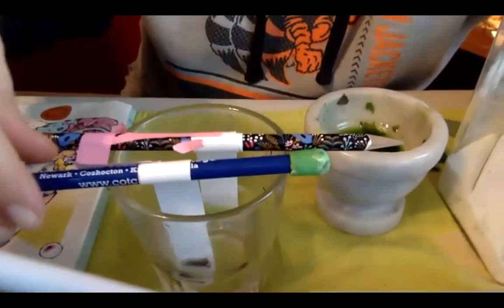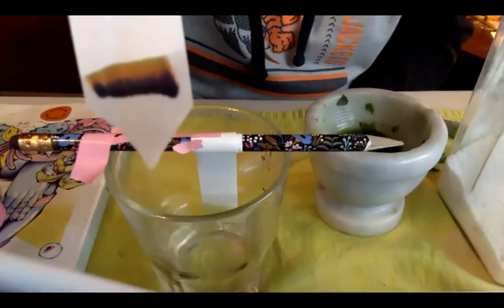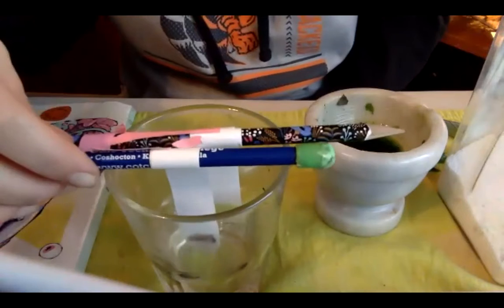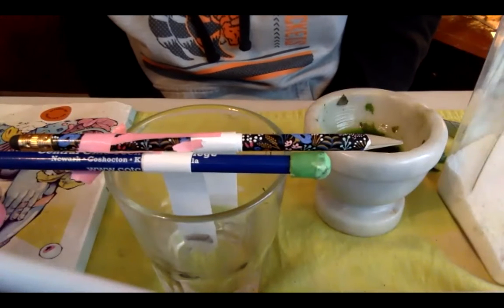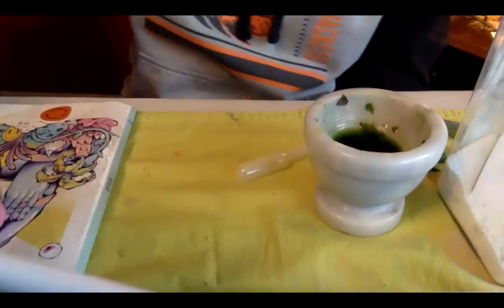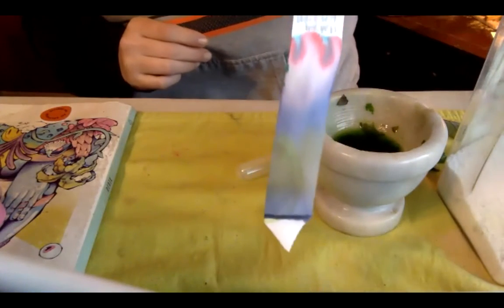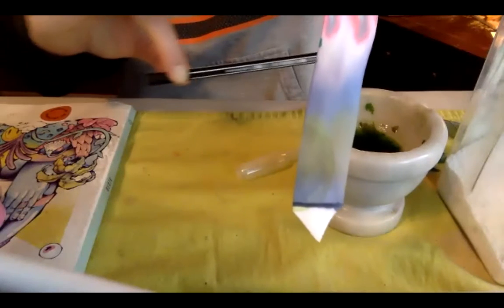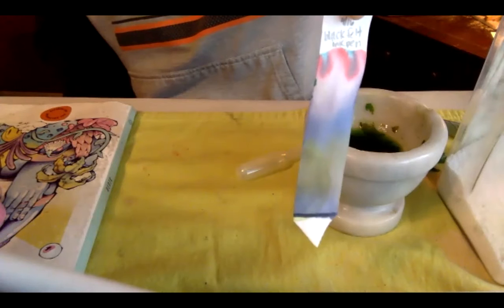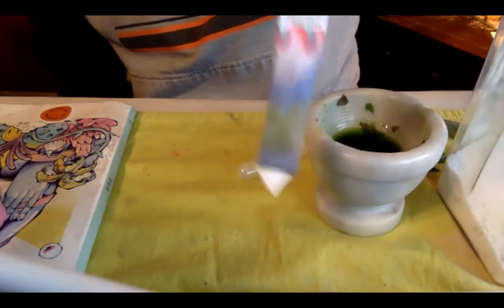So, well, you can kind of see our pen ink is doing what it does right away. Start getting the warm tones. Warm tones always kind of settle out first, it seems like. Oh yeah, and this can take up to 30 minutes. I can show you an end result. What did I just do? Pen ink. There's 30 minutes. Oh, wow. Yep, all of that is in the black marker. And again, any black, because black is all the colors together. So why, when you mix the Easter egg dyes all together, it just comes out like a gross greenish brown instead of black?